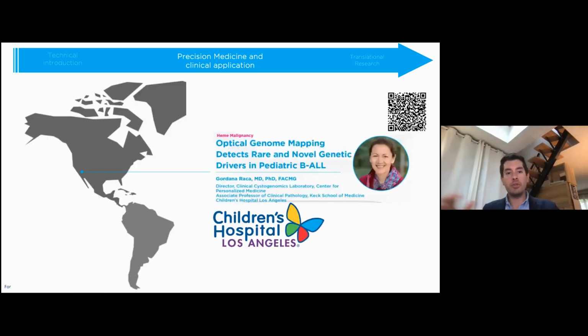I would like to switch to another example, and this identification of a missed variant really has a tremendous potential in precision medicine to bring an answer to patients that are negative for all testing methods. And Dr.